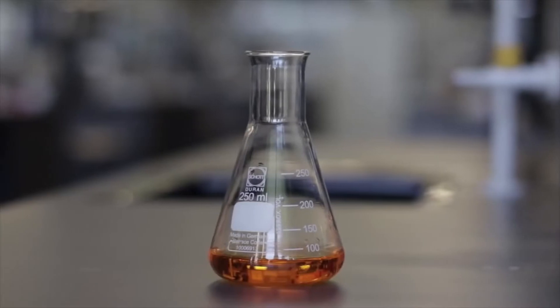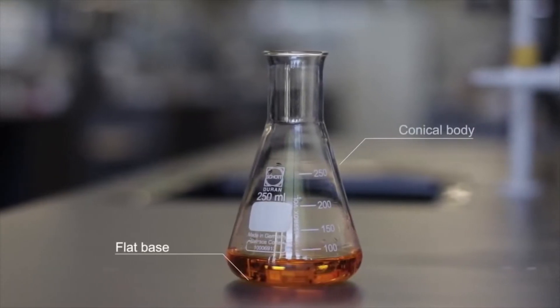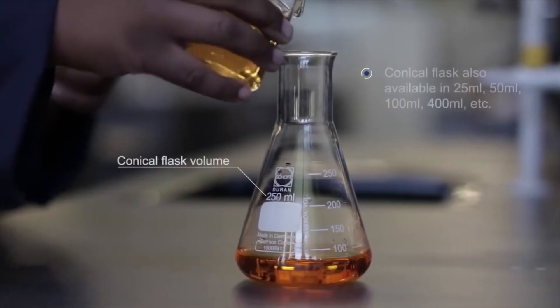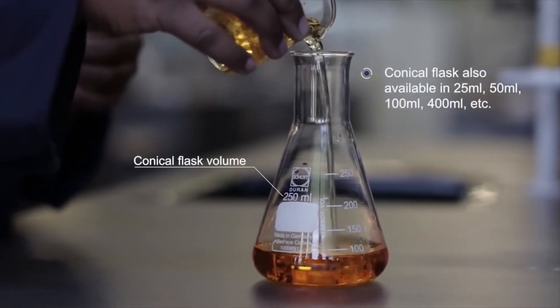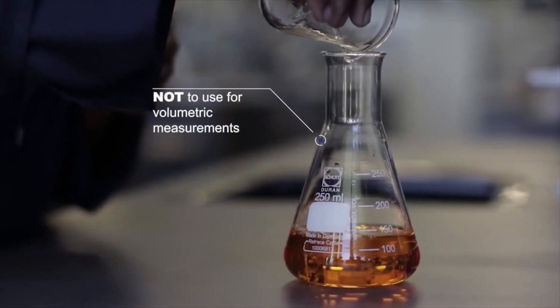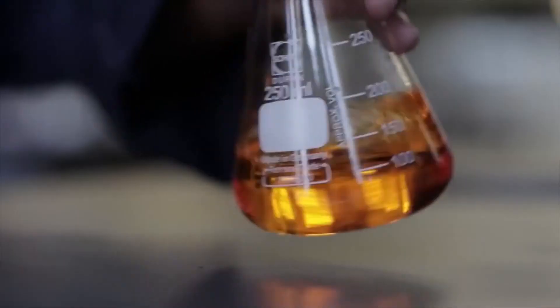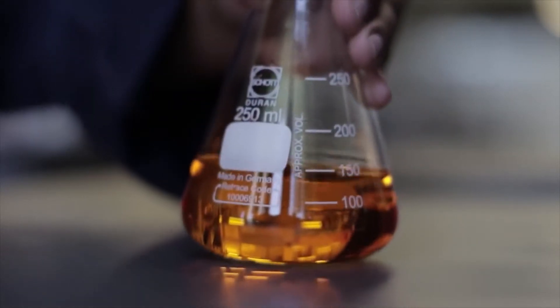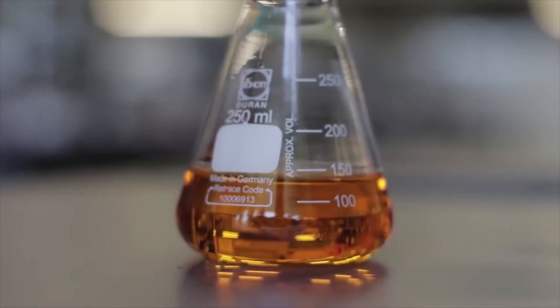It possesses a flat base, conical body and a cylindrical neck. A conical flask is found in different volumes. This glassware is also not for accurate volumetric measurements, but is used to mix contents by swirling without the risk of spillage. One example of its use is during a titration.